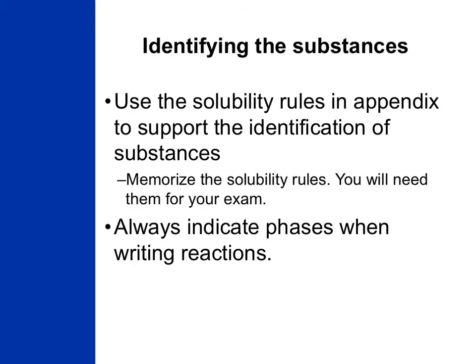This experiment is really going to emphasize the solubility rules. So you want to make sure that you look up the solubility rules in the appendix to the lab manual and memorize them because you're going to need them when you go and take your exams. In some cases, some substances don't react following the solubility rules, so those are going to be indicated in the lab manual in the experiments reading.